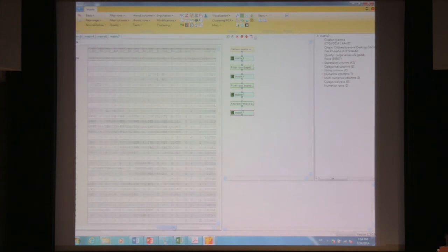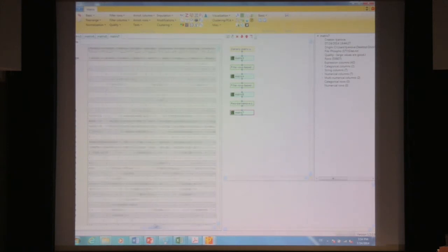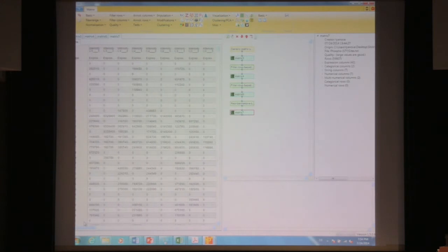So now if we have a look at what columns we've got, there's no reverse and contaminant columns anymore. And in the same way, you can reorder columns. It's just sometimes not nice to have empty columns, but it's really just to show you guys how to do it, because it hasn't been covered.